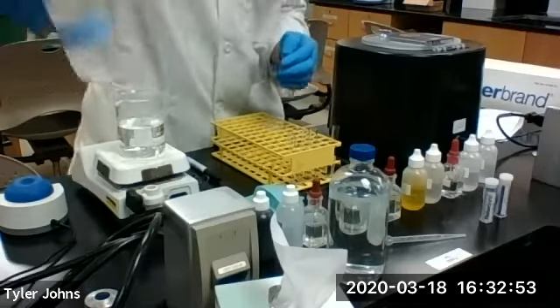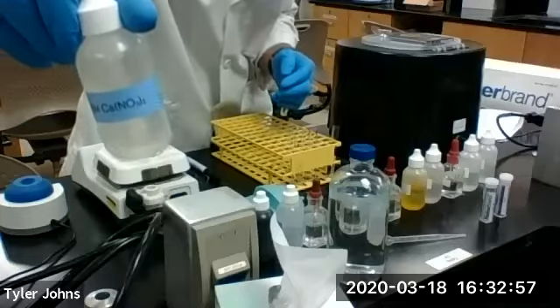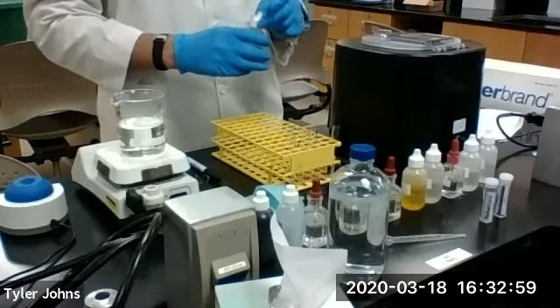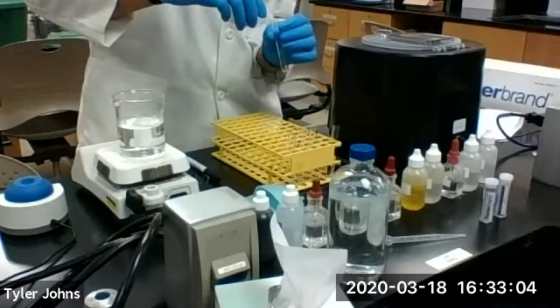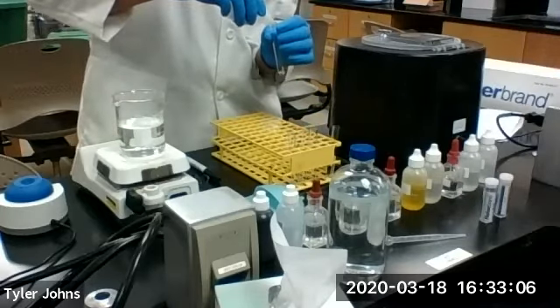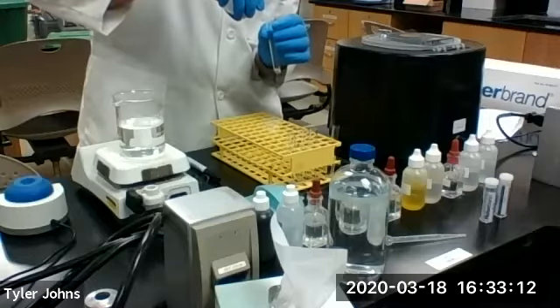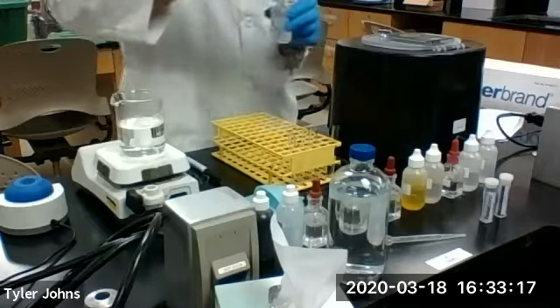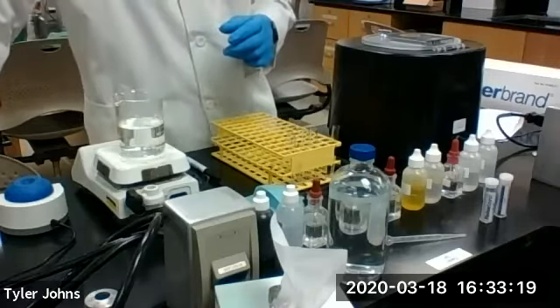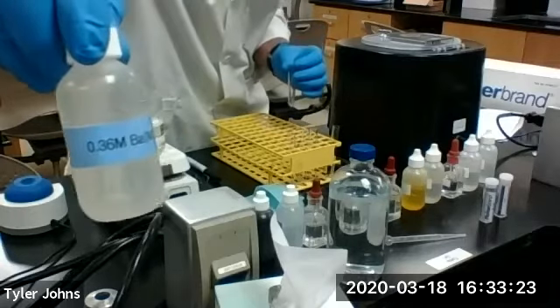Then we're going to add the same amount of drops of our calcium. And finally, we're going to add an equal amount of our barium.